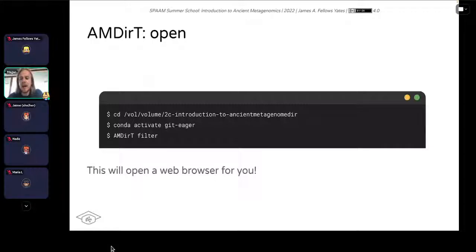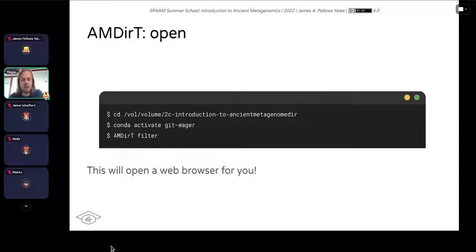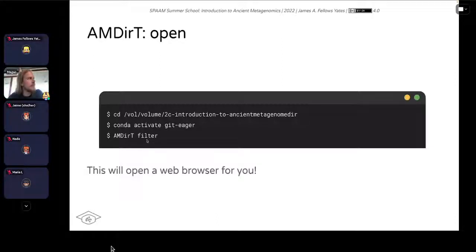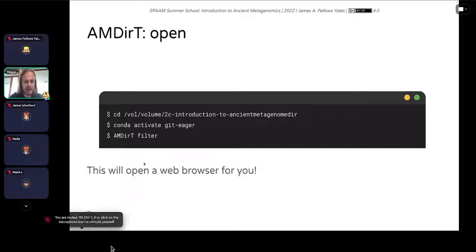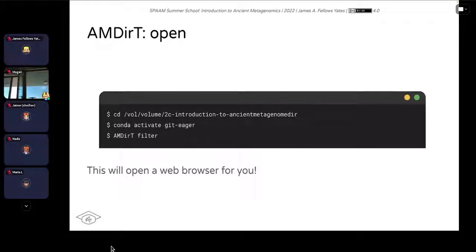Once you're in that directory, make sure you have activated your git-eager conda environment — you should see git-eager in your command line prompt. Then type in 'AMDirT filter'. I'll give you a minute to do that.